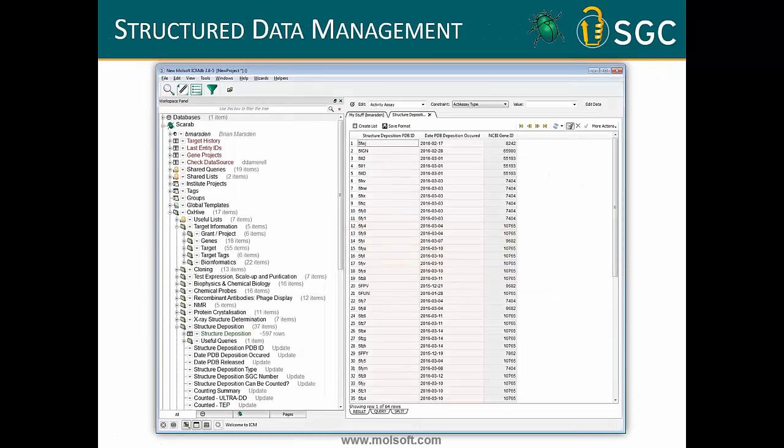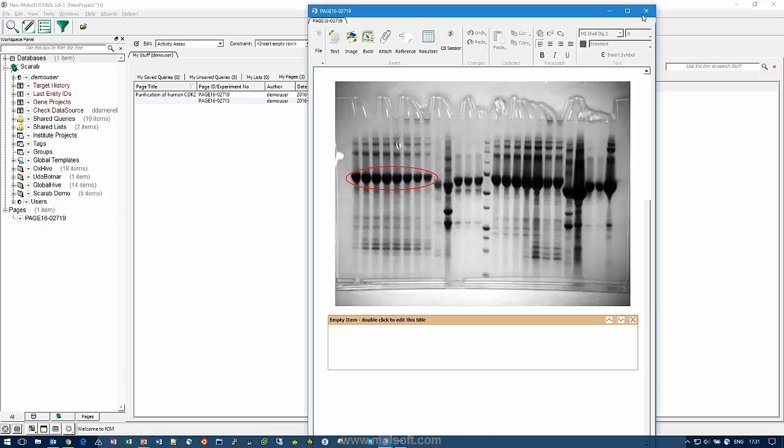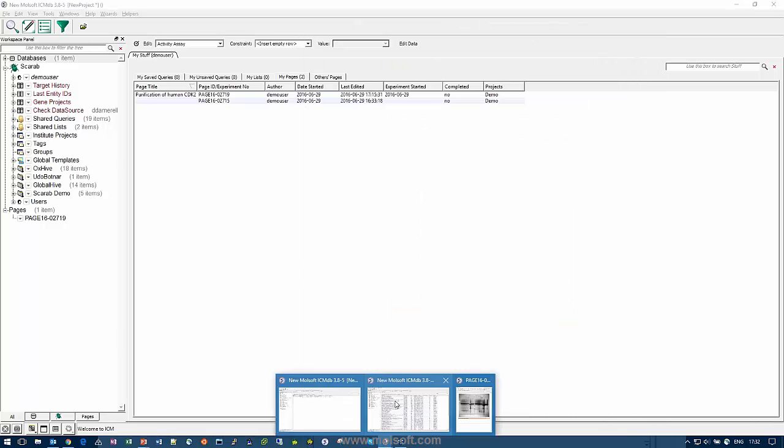So I'm going to try and do a demo of this now and see if this thing actually restored itself or got stuck. I'm just going to kill it. Now that died. So I'm going to do it in my other session, which is this one.